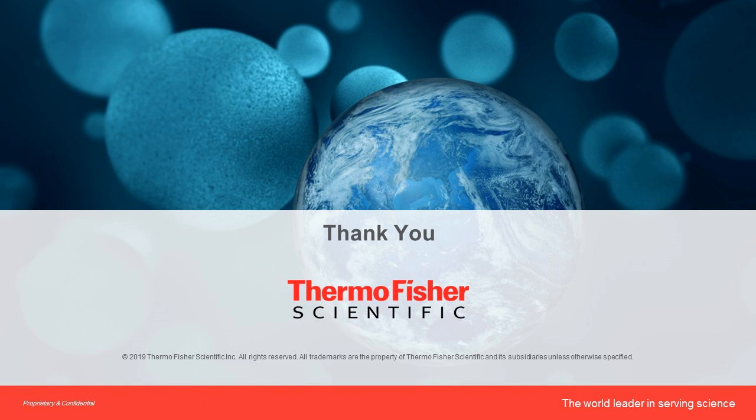Okay, and I think this question is for John. Where and how would HIC be implemented in a mAb downstream purification platform?